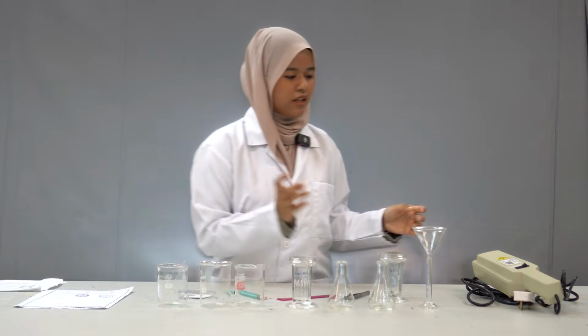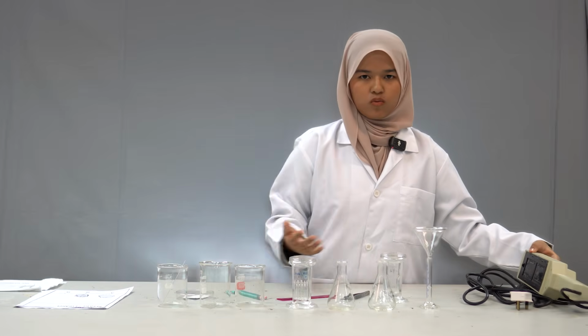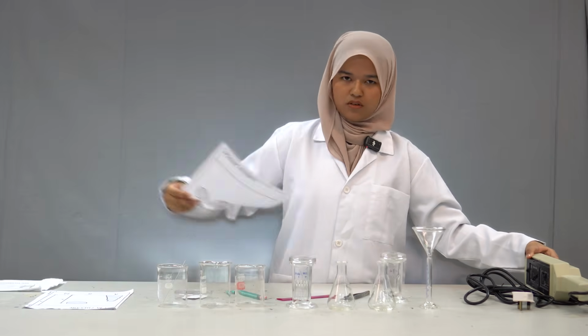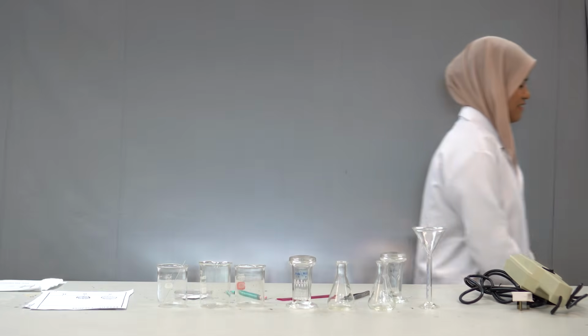Okay, I forgot to mention that after we have obtained the TLC plate, we need to use the UV light for us to visualize the spots on the TLC plate. When you are using the UV light, you need to at least have a cover like this, so that the UV light does not get into your naked eyes. So that's all from me. I will pass to the next presenter.